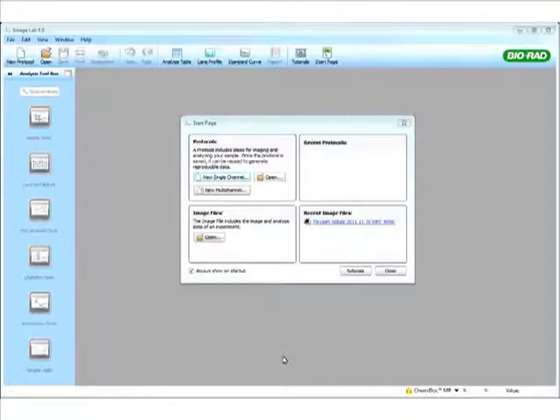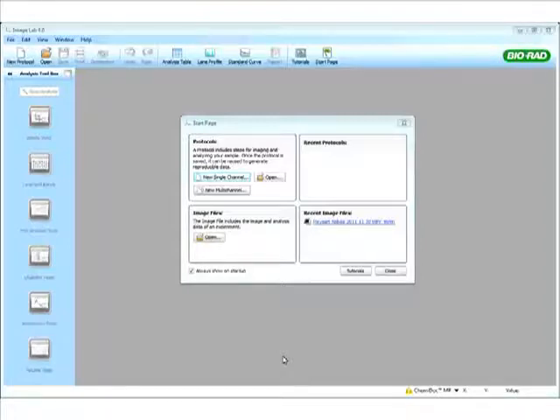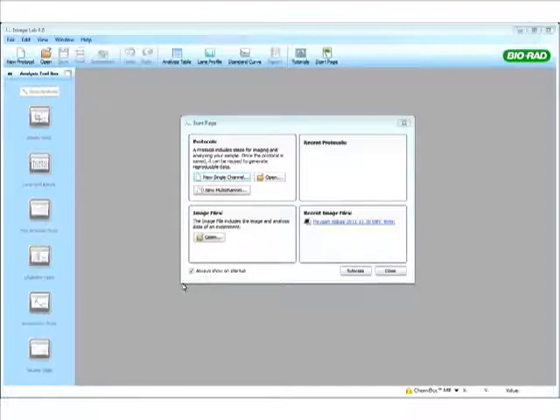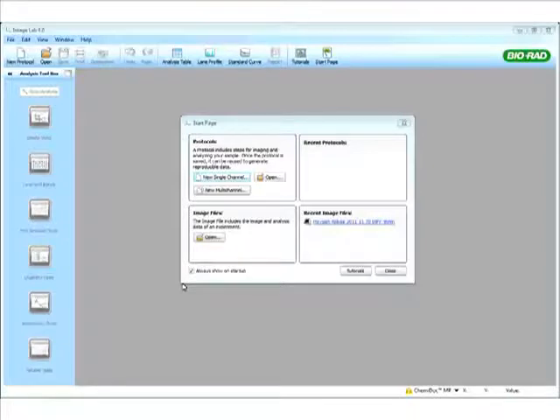The Chemidoc-MP is a multiplexing system that can be used to detect bands on a chemiluminescent blot, on a chemifluorescent blot, and also on nucleic acid gels and colorimetric assays. So it's really a nice tool with high versatility to look at different applications.